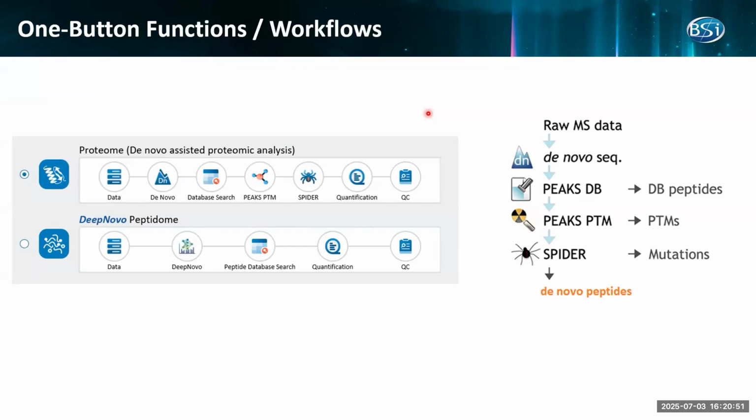How much of those proteins? On the other hand, the peptome workflow is, given a data set, what are the peptides present in this data set? The protein or other source information is trying to tell us where this peptide comes from.